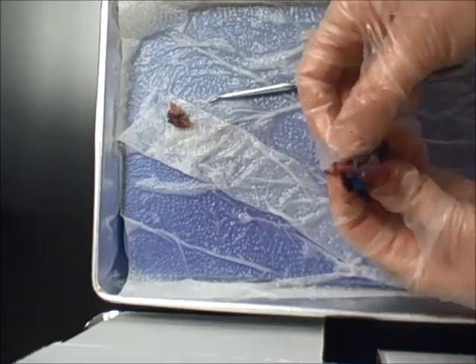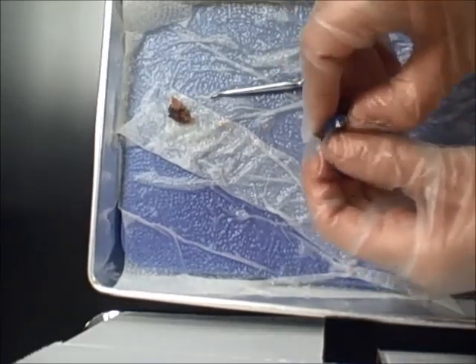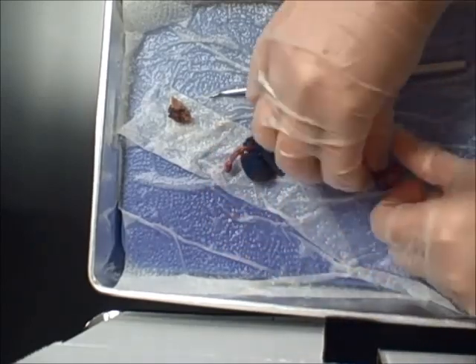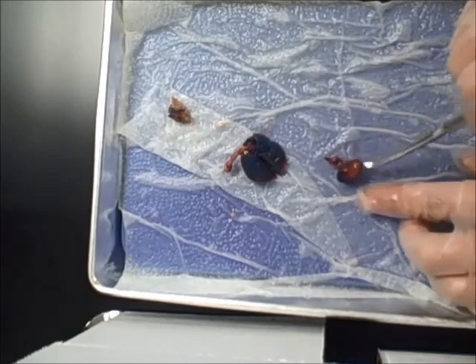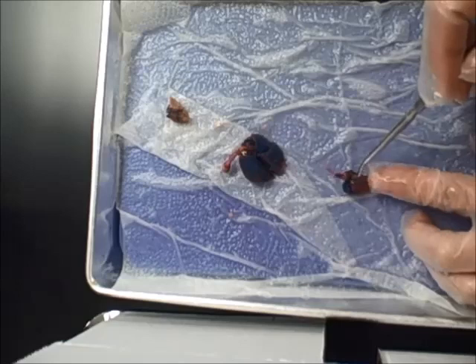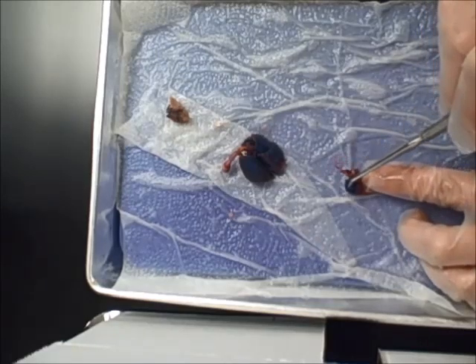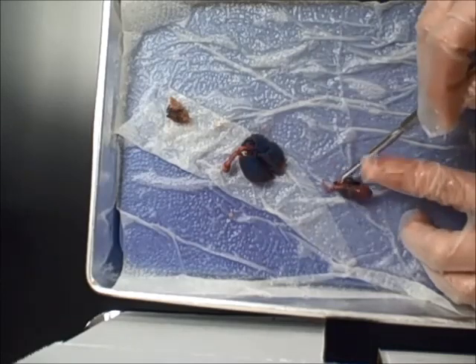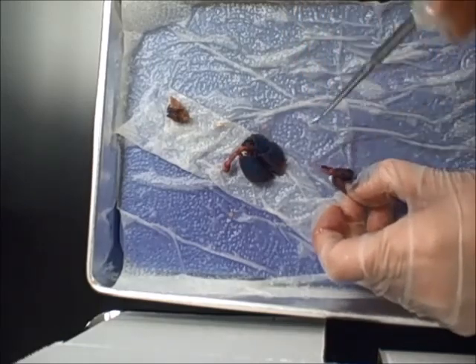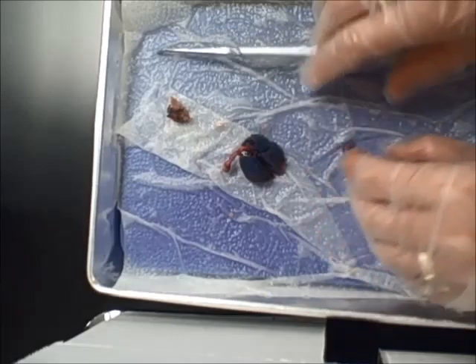Top 2 chambers are atria. The bottom 2 chambers are ventricles. We separate the heart from the lungs. All right, so the heart's right here. So the bottom 2 chambers would be the ventricles. Top chamber, there's the right atrium. It's blue because it has the deoxygenated blood that's being received by the heart from the body. Over on this side is the left atrium. Left atrium right here receives the oxygenated blood from the lungs.